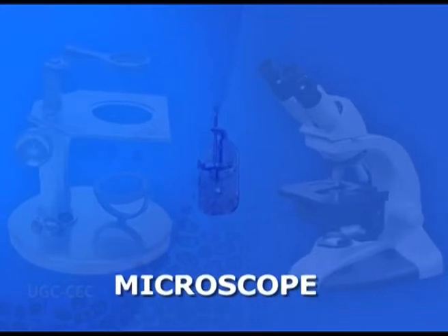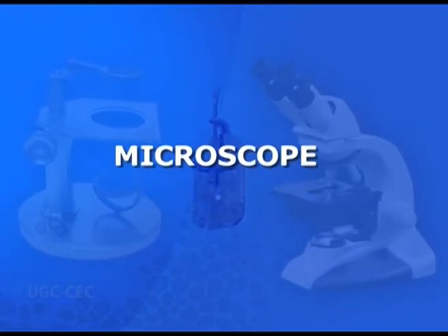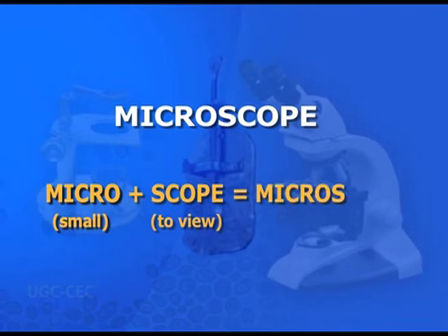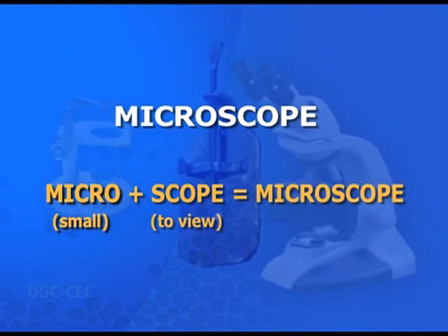What is microscopy? Microscopy is the technique of seeing or visualizing the objects which cannot be seen with unaided eyes. If one tries to define microscope, as its name suggests, micro means small and scope means to view. Hence, it is an instrument that allows us to look at small objects which can't be seen under normal circumstances. Microscopy is the technique because of which biology could reach up to its adulthood. You cannot think of modern discoveries made possible without the use of microscopes. Invention of microscopes in biology is like the invention of the wheel in human history.